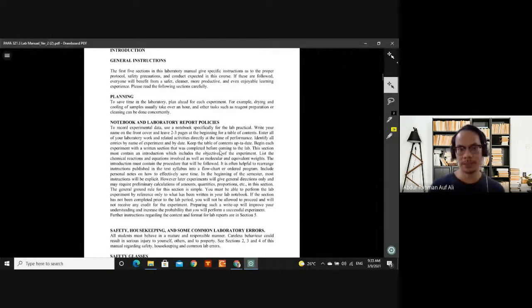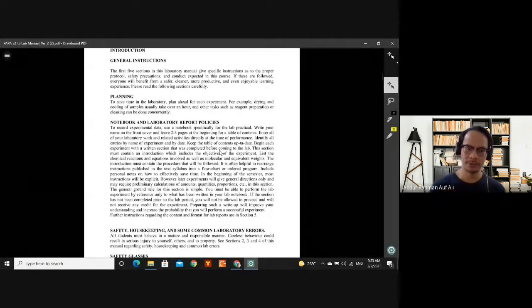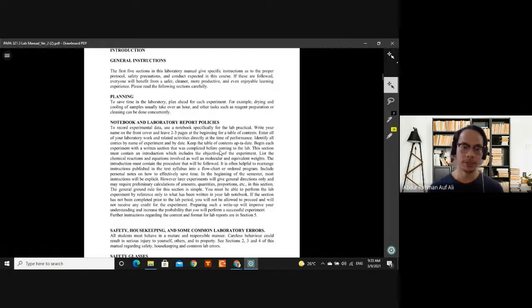Okay, because chemical spillage, kalau chemical tertumpah ke, ada like small explosion ke, bukanlah an explosion. Dia macam when you mix certain chemicals, dia boleh produce a certain pop. Okay, dia macam mercik sedikit. It looks like an explosion but in a smaller scale. So kalau ada terpercik, ada macam meletup, it will protect your body and your arms, any exposed skin from those chemicals. And also you have to wear a face mask and goggles also to protect yourself.